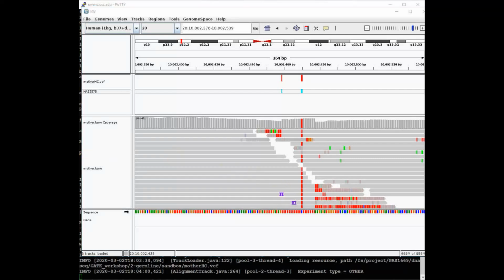So haplotype caller has a parameter called bamout, which allows us to ask for the realigned reads. These realigned reads are what haplotype caller uses to make its variant calls. So you will be able to see if a realignment fixes this messy region.